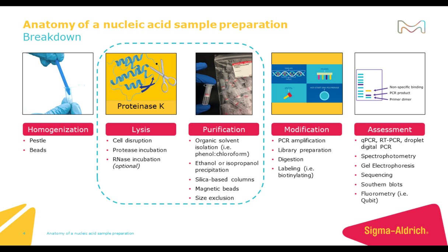The next step is breaking open the sample and digesting any unwanted biomolecules through that lysis step. For nucleic acid sample preparations, typically a lysis buffer is added that will assist with breaking into the cells. Proteases, like the ubiquitous proteinase K, are used to digest the proteins that can degrade the nucleic acid. Optionally, if assessing for DNA, sometimes an incubation of RNase is performed, or if RNA is assessed, a DNase is used.